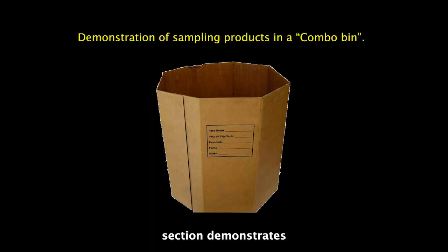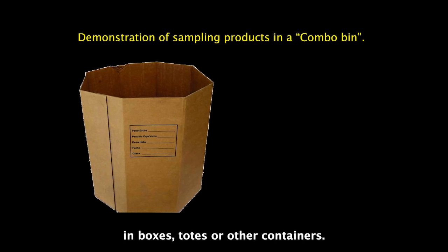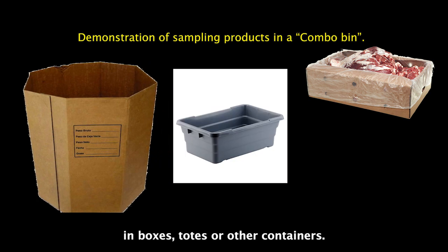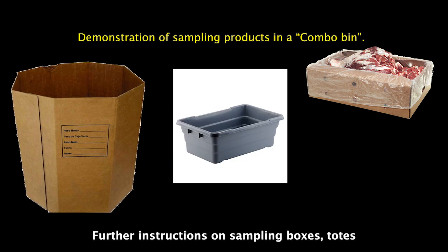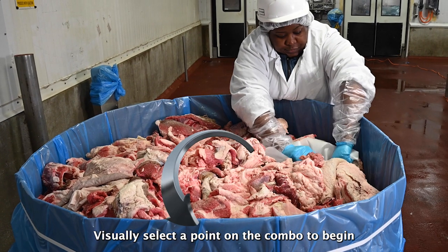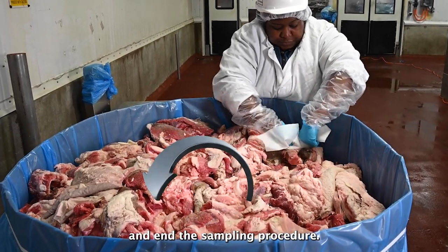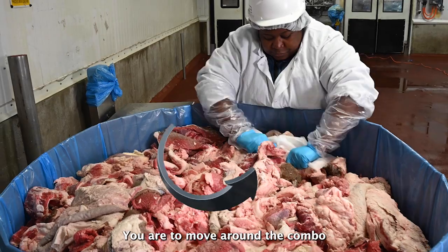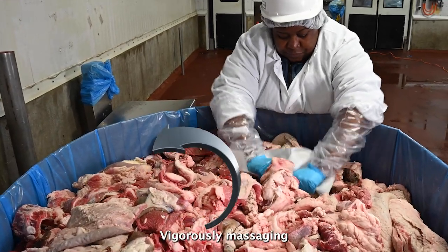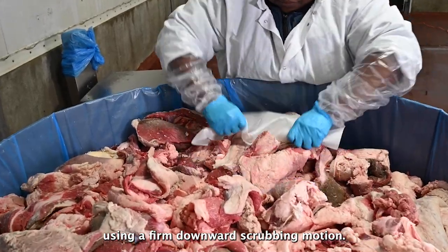This next section demonstrates sampling product in a combo bin. Most of the instructions also apply to product in boxes, totes, or other containers. Further instructions on sampling boxes, totes, and other containers will be covered later in this video. Visually select a point on the combo to begin and end the sampling procedure. You are to move around the combo in a uniform manner, vigorously massaging the entire surface of the combo using a firm downward scrubbing motion.